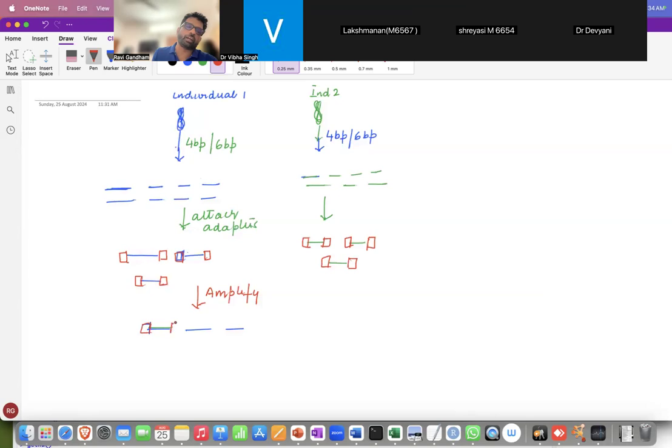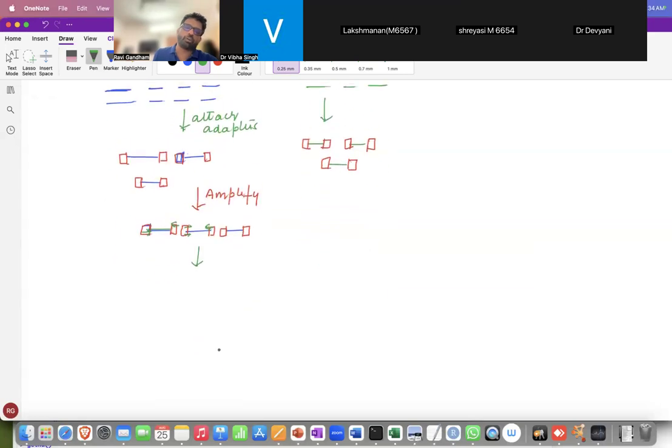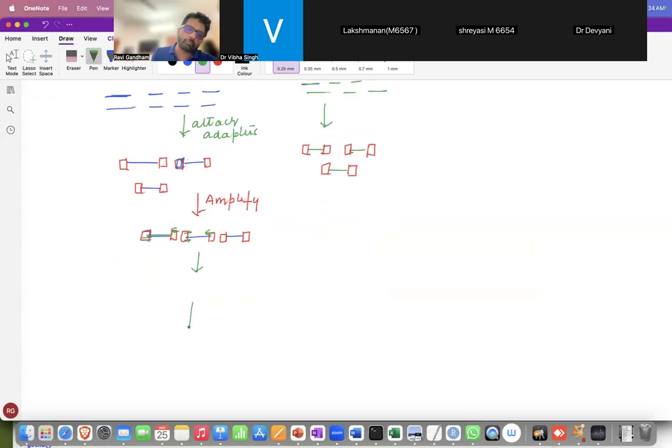You have it here, here, here, here, here, and here. Your primers would go and bind to this place, this place, this place, and this place, and likewise. Now, after amplification, what do you do? You try to run a gel. Let us say we are trying to run a gel.